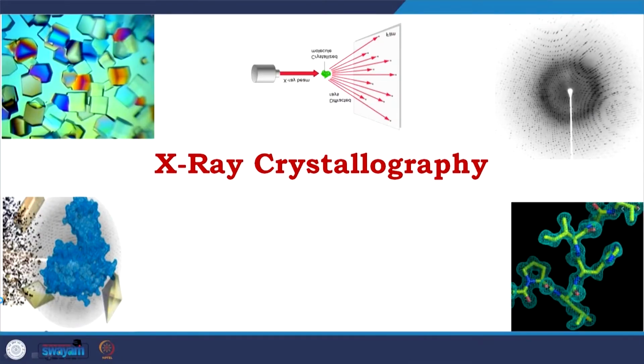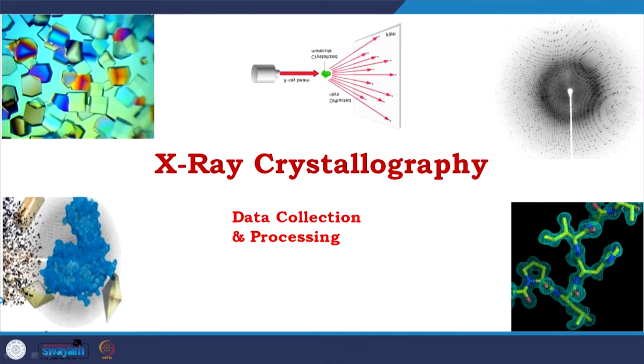We are continuing with the structural biology techniques, and again in structural biology techniques we are talking about X-ray crystallography. Today is the last class of the module, and in this class we are going to discuss data collection and processing. But before that I would talk about the journey so far. So, the journey of X-ray crystallography technique, what we did, what we learned.